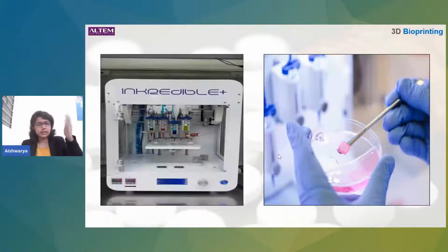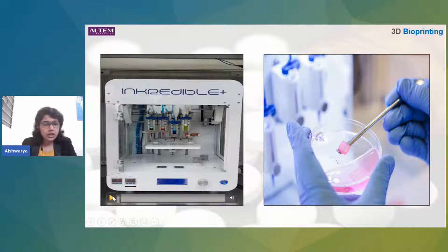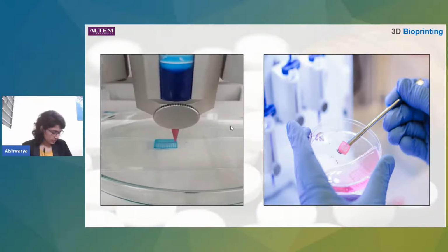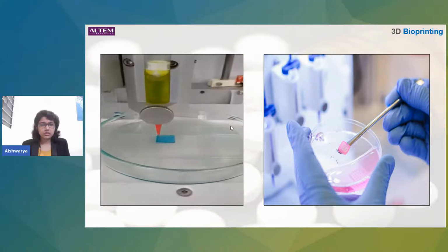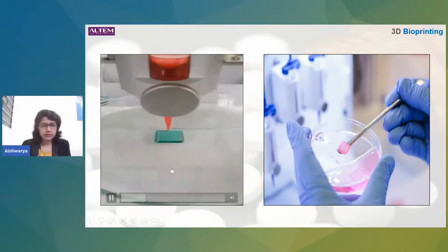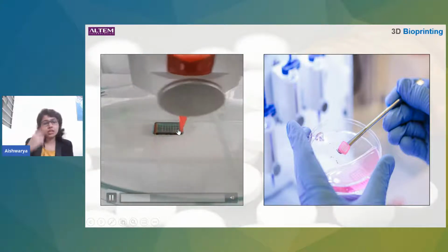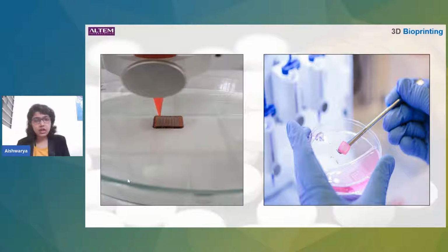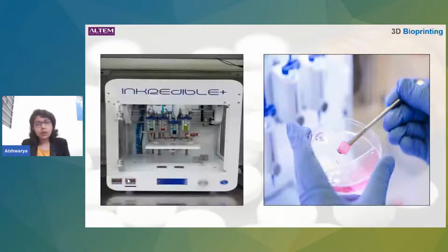So, with 3D bioprinting, obviously, I'll just give you a very simple example here. Right, so they're just doing the extrusion and they're trying to print a simple structure. So this is where you would use a set of print heads, to create multiple structures, maybe with multiple cells or maybe with multiple materials to create a more complex structure. I know that this looks like a very simple structure, but you can create more complex forms, which can obviously replicate the physiology or the anatomy of humans. So, with this, I will now come down to the cases.